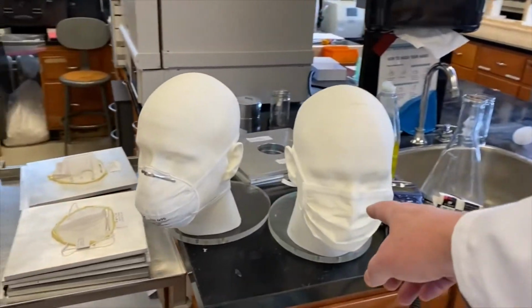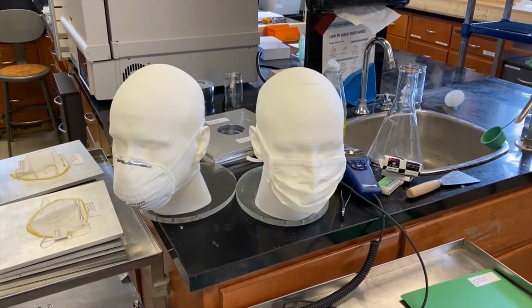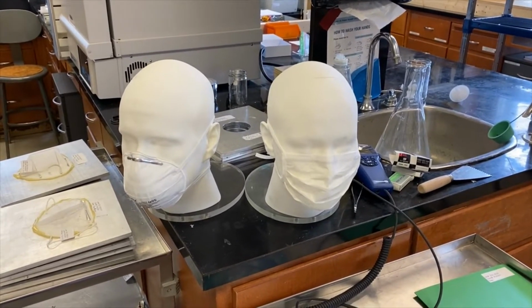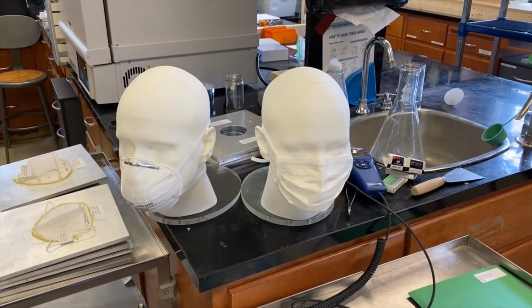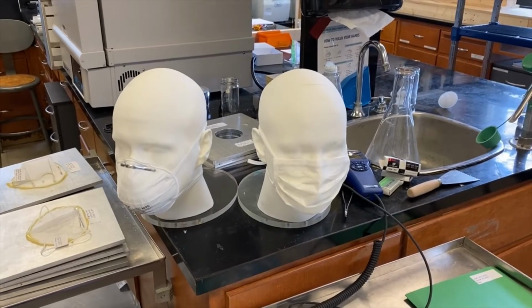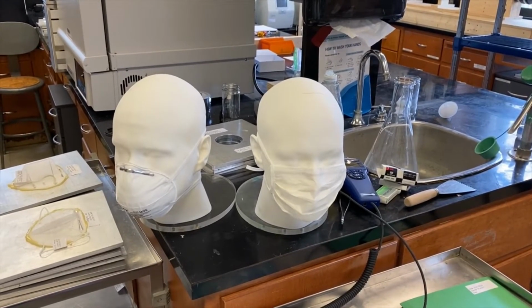By contrast, medical masks are tested against a standard called ASTM 2100. Part of that ASTM 2100 test involves a filtration efficiency test that we call ASTM 2299. I know, this is really a lot of acronyms. Health Canada recognizes ASTM 2299 as the de facto filtration standard for medical masks. For non-medical face masks, there's also a very recently released testing method available from ASTM, but I won't discuss that now, although our laboratory does have the capability of conducting that test.